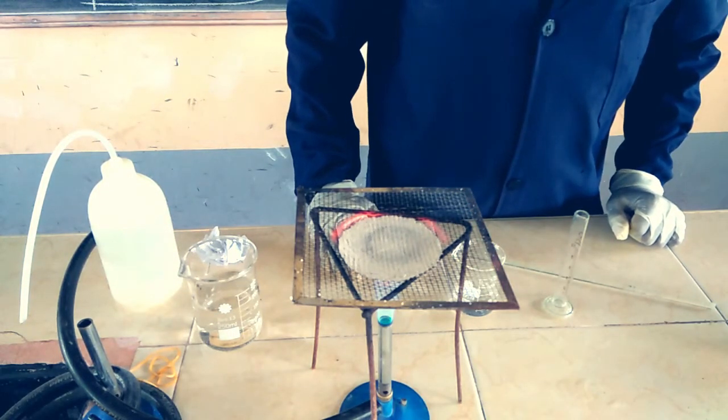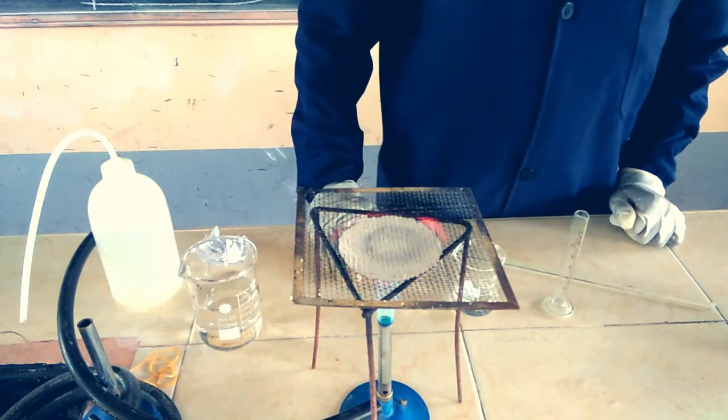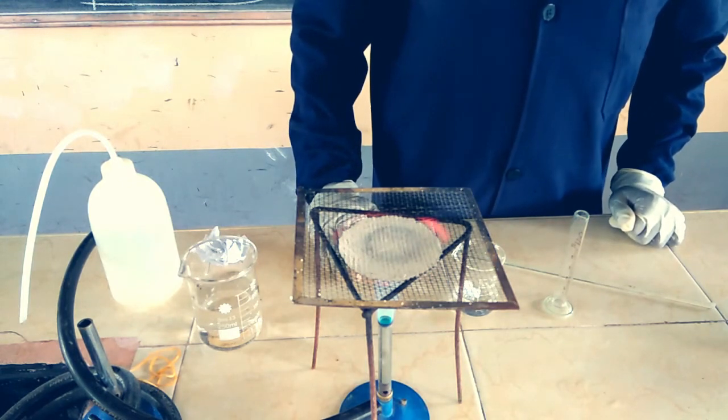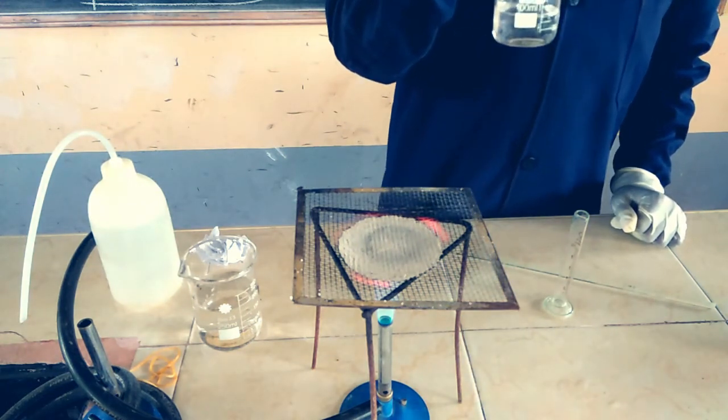I'd like today to look at how you can separate a soluble solid from a liquid. Today I have a mixture of sodium chloride and water. Sodium chloride is soluble in water, and we want to see how we can get back our sodium chloride from the water.